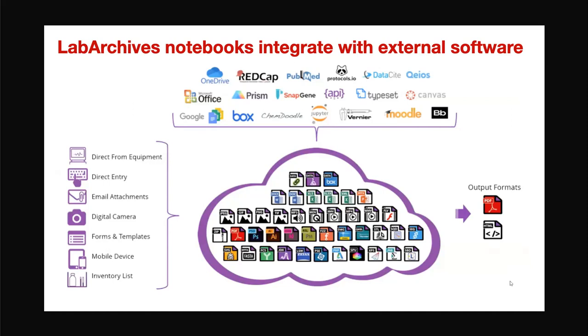Michele, there was also another question I got sent to me, whether LabArchives is suitable for bench research or clinical research. It can be both. I mean, it's basically just a lab notebook. You will see with the interface, they did it maybe even to an excess just to replicate a notebook. But you can see that it can integrate with REDCap. But it's just a notebook. You can configure it as you want. You can add all the templates that you want. There are a lot of things called widgets that you can add. So you can use it both for clinical research and bench research.